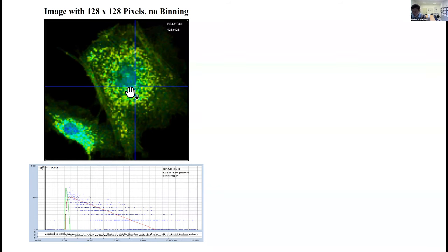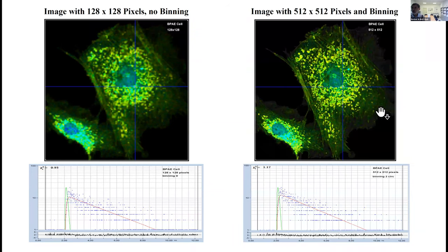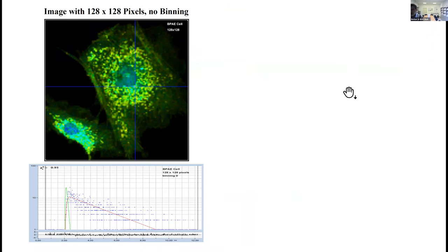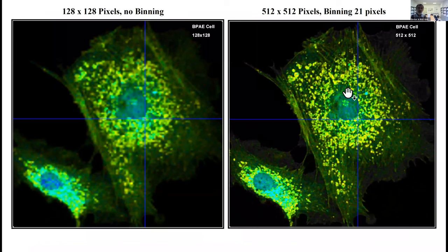If you do that, you get more photons in every pixel but you have very poor resolution. This is an image with 128 by 128 pixels. It has wonderful decay data in the pixels. You get good accuracy of the lifetime, but the image looks blurry. If you record the same thing with 512 by 512 pixels with the same average photon rate, the same laser power, the same acquisition time, and you use binning in the lifetime analysis, you get the same effective number of photons in the pixels but you have 512 by 512 pixels now.